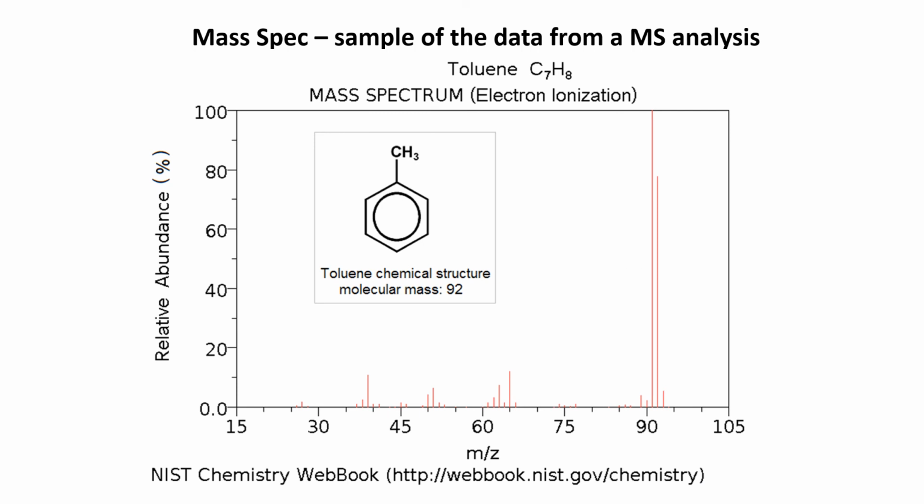In case you were wondering what the mass spec actually looks like, this is a picture of mass spec data, uninterpreted. So the computer takes this, compares it to libraries that also look like this, and then comes up for us with, okay, this is what it matches in terms of molecular structure. And they do that by interpreting the breaking of the pieces. So what we're saying is every time you drop a piano that's the exact same brand of piano from the exact same height, you would expect to get similar pieces every time.